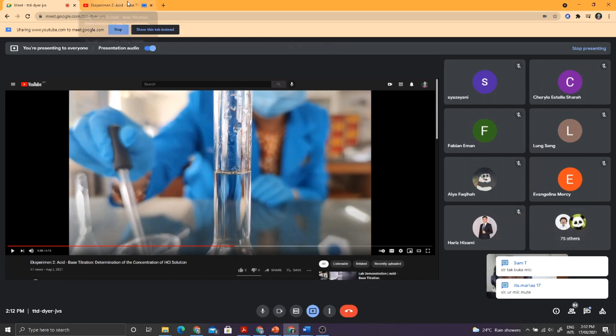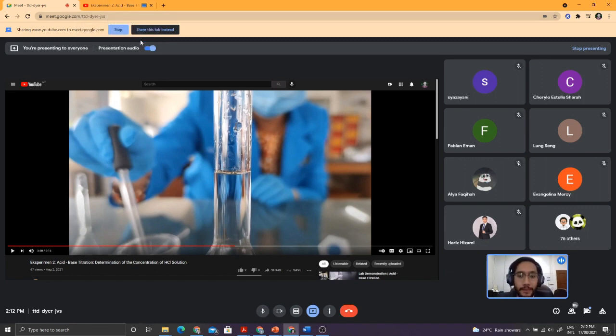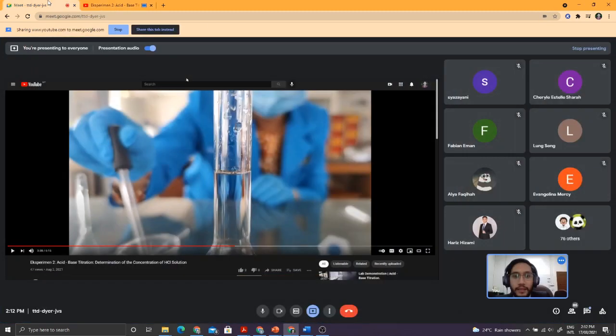So I'm just saying, untuk nanti lab test, for this part, untuk volumetric flask, you are doing a dilution punya process. Be very careful when pipetting the distilled water lah. Kalau you lebih, the bottom meniscus tu lebih daripada the line, terlebih banyak sikit pun, what you have to do is you kena buang semua ni, you kena start over. Okay, because we are doing dilution, we want a precise measurement.